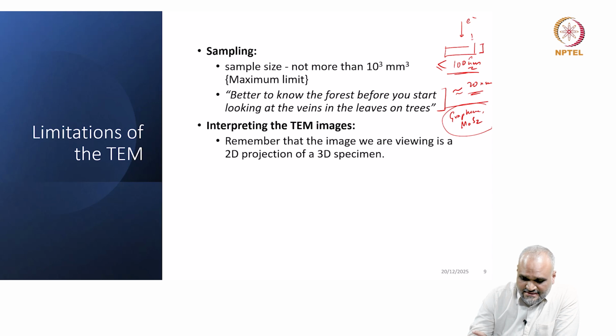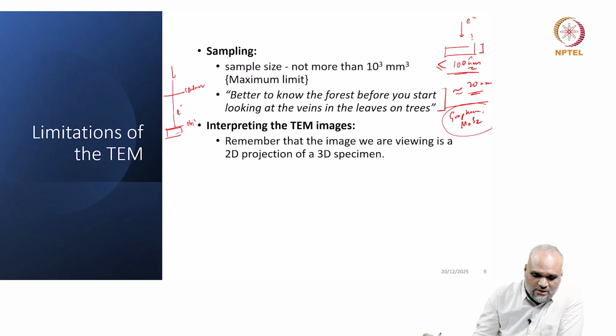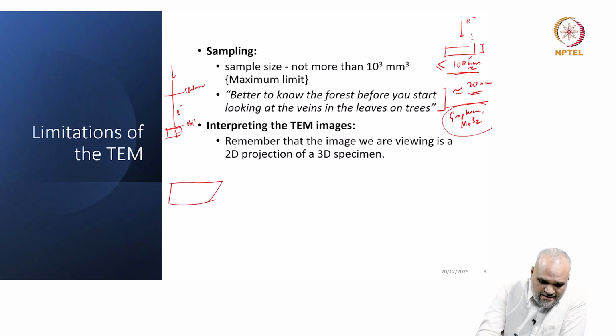In addition, when I look at the construction of the microscope, I'll just draw a brief schematic here. If I call this my condenser lens, and this is my objective lens, and I place a specimen somewhere within my objective lens, I have a source here, an electron beam going through my sample. It has to penetrate through my specimen and then go on, and I get information which is recorded below the specimen on a screen.